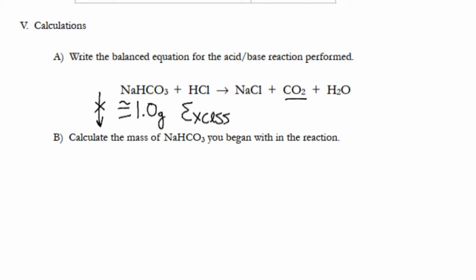The salt and sand lab, right? Guys, amazingly, we're talking now about something you learned to do in September. Now, guys, if you remember doing the salt and sand lab, you'll remember that we put a cover on the dish. Why did we do that? Because it splatters. So what we're going to do is weigh a dish with a cover, and then, guys, we're going to boil off the water, and what's left is the salt. And again, through mass by difference, we can figure out the mass of the salt. So this leaves through boiling, and this then becomes our product.